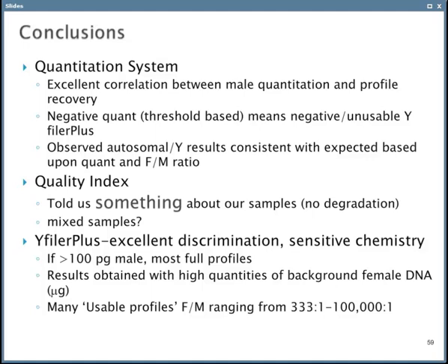In Yfiler Plus, it was excellent discrimination, very sensitive chemistry. If greater than 100 picograms of male, we mostly got full profiles. We obtained results from high quantities of background female and many usable profiles, even with female-to-male ratios ranging from 333 to 1 to 100,000 to 1.